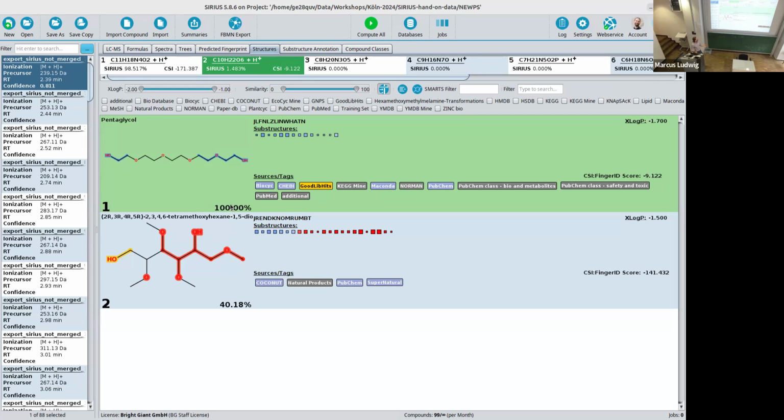But it was always a little bit misleading, so for the next version, we keep it out because we rank by this score. This estimated Tanimoto we only included because people know the Tanimoto. So that's why this is the important one. You also get something like log P estimated from the structure if this is helpful to you.